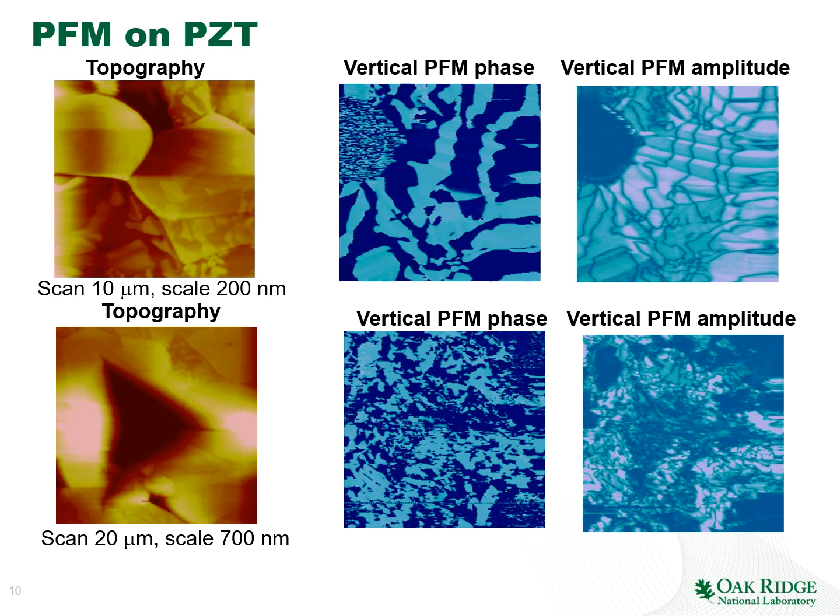You can see that the amplitude on the boundary between the positive and negative domain actually goes through zero, and we can clearly see meandering domain walls going throughout the material. In this case, the domain patterns are relatively complex because this is a rhombohedral material, so we have a lot of rather beautiful domain configurations.